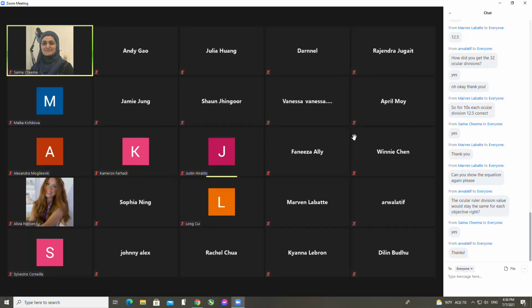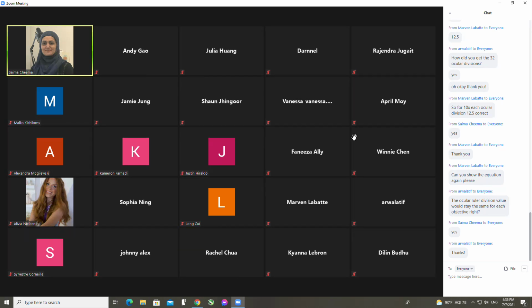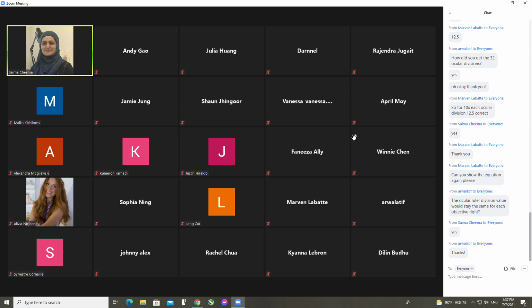Professor. Yes, Rachel. Sorry, I know I have a lot of questions. For the pollen at 100x, the ruler is smaller than the pollen. So how do I calculate? You can approximate it, but when you did it for 10x and 40x, what measurements did you get?